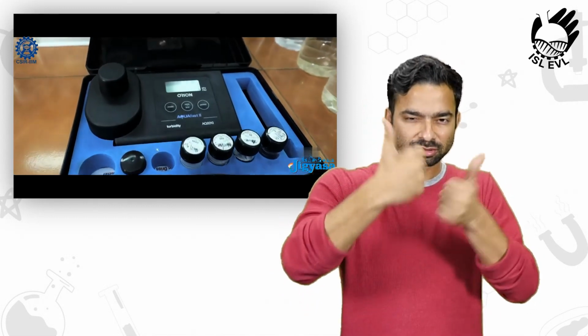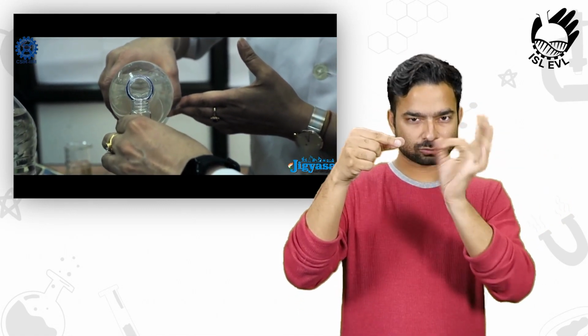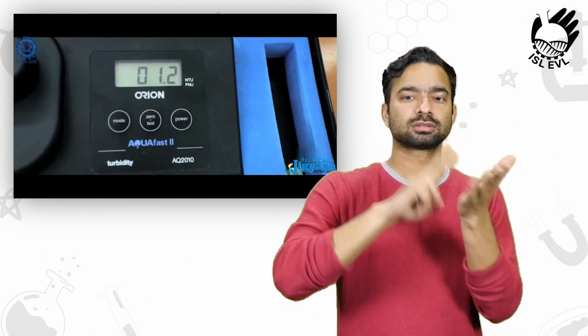Going to the next parameter, we are now going to see turbidity. This is the turbidity meter. These are some of our secondary standards. Here is the sample tube. We are going to fill our sample in the sample tube. The sample will be poured into the test tube up to the mark, and this is the sample holder. The sample is being put into the sample holder, and here comes the reading, and the reading is 1.2 NTU. Well, within the range. The range is from 1 to 5 NTU.